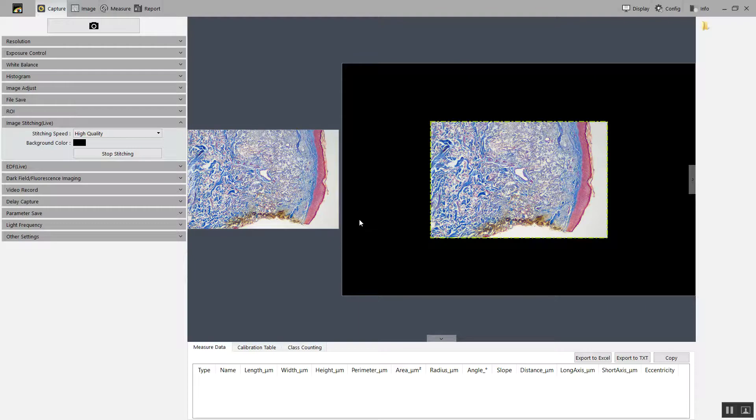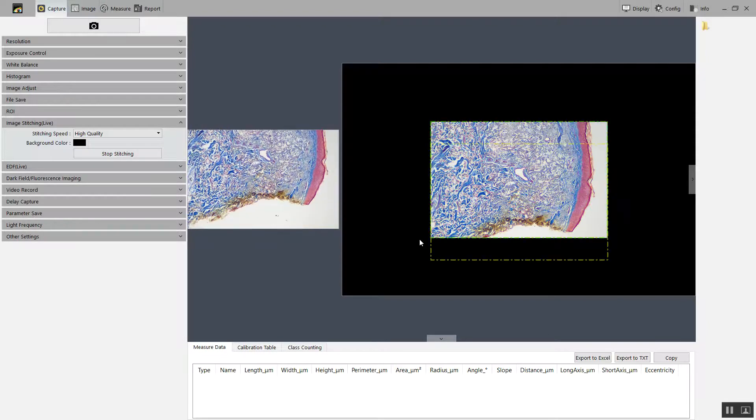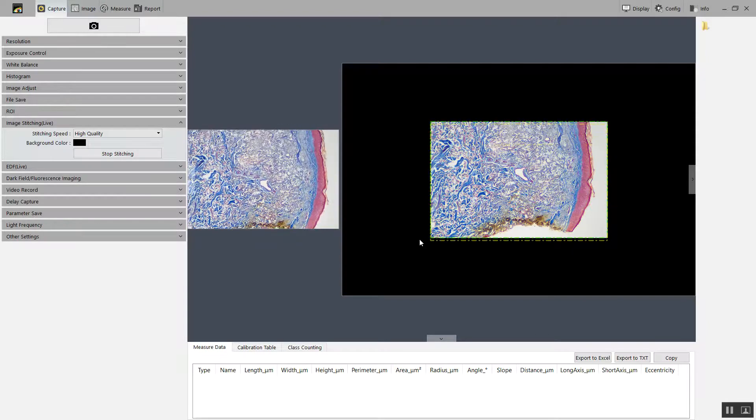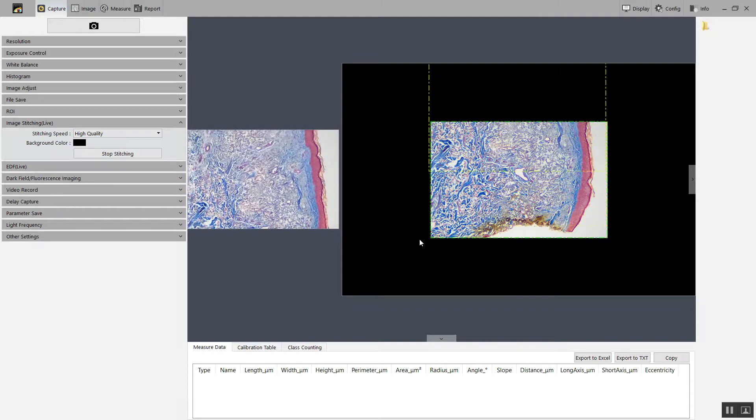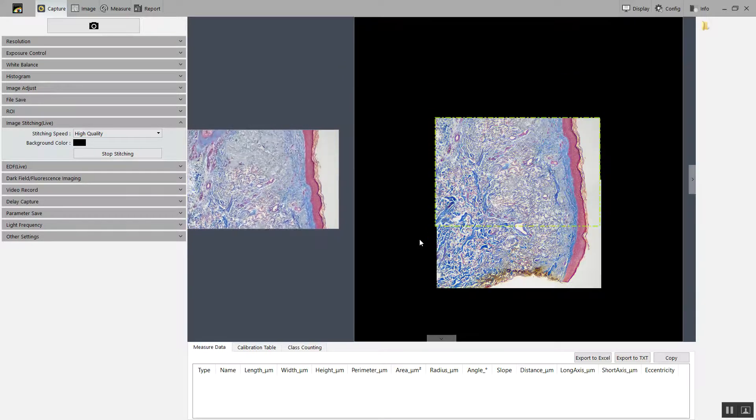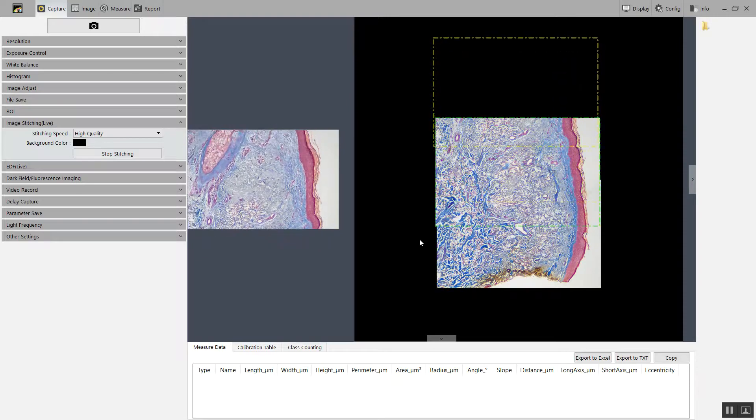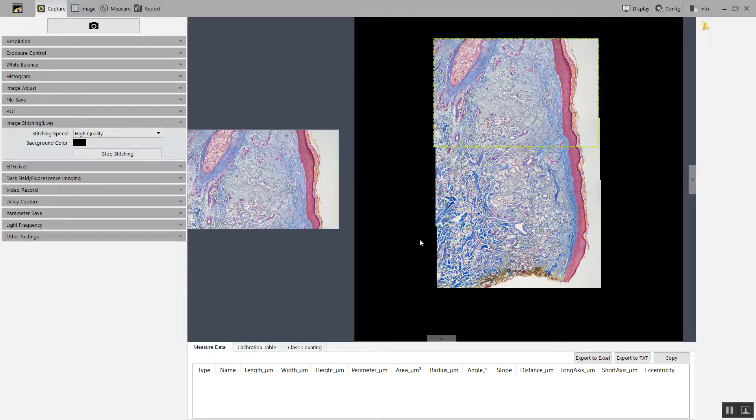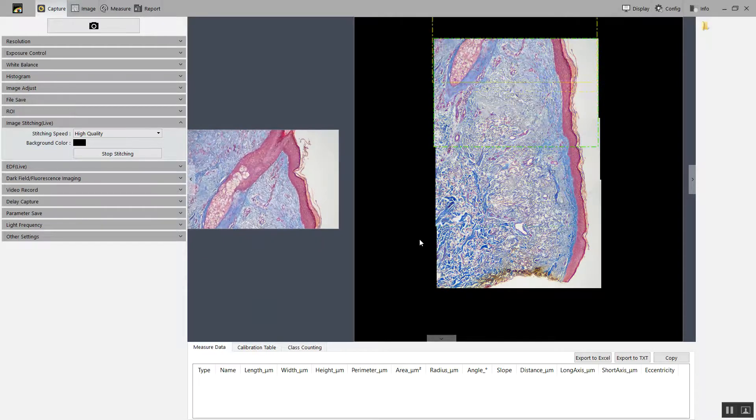You get the live window on the left, and then this is the build-up of your stitching on the right. Move slowly. You can see the yellow window is the frame of the camera as it moves up, and it begins to add to the stitched image.